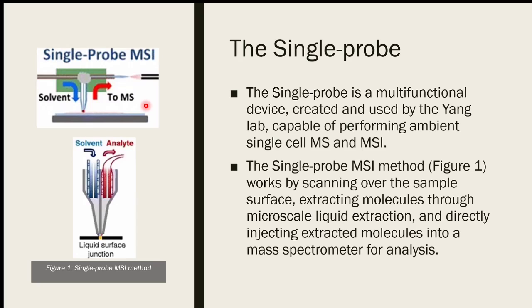Do you anticipate, and this may be outside of the work that you've done, let's say you're probing for a specific analyte. Could you alter the solvent to improve the signal from that analyte? Like, if it's more soluble in a particular solvent, could you try and target it? Yeah, I believe I can, to a degree that would help. I know from what I remember, Dr. Tien used a large part methanol within his solvent. So that might help with certain analytes as well.